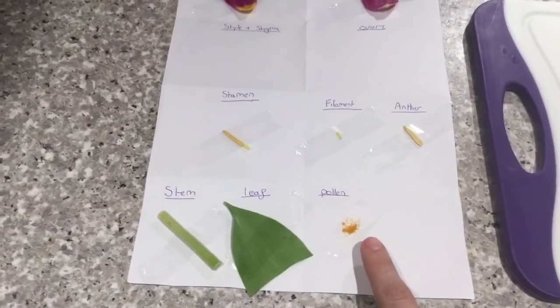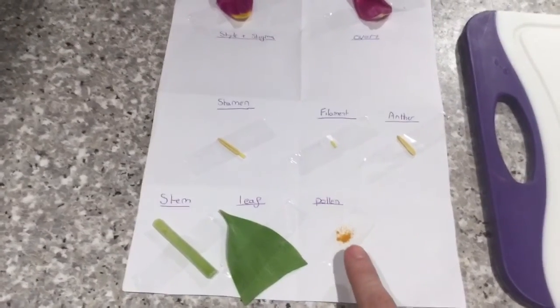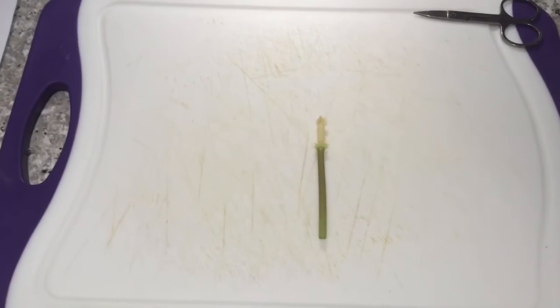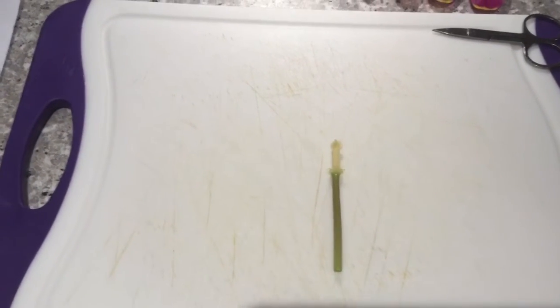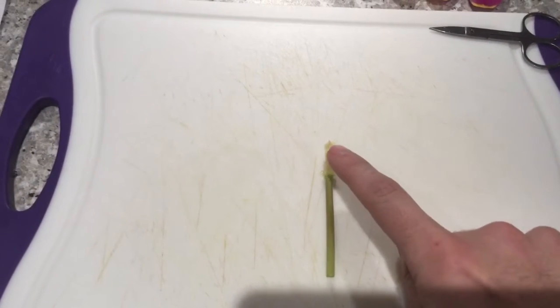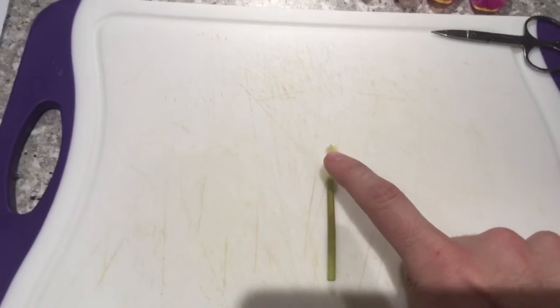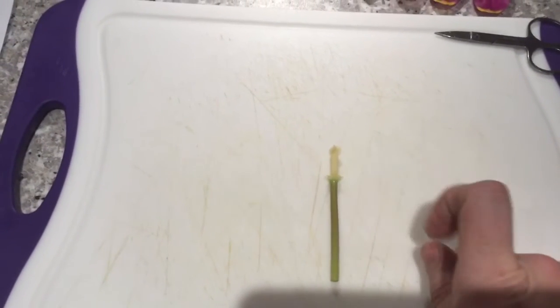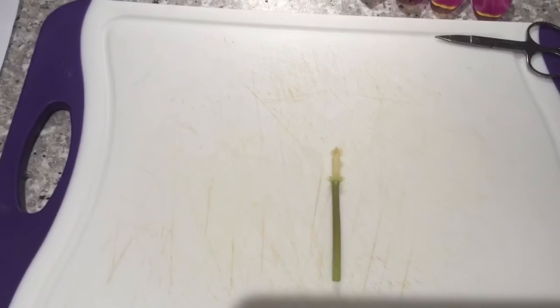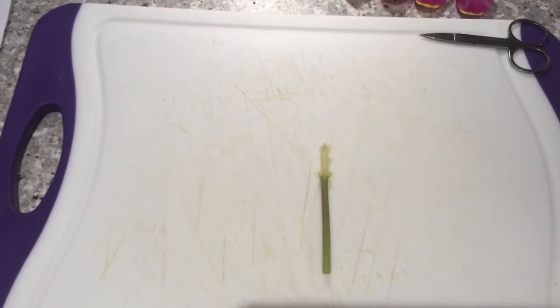You might not manage to get pollen — it just depends how developed your flowers are when you're dissecting them. Coming back to our flower, we're left with the stem which is connected to the ovary, which is then connected to the style and the stigma. So I'm going to cut this top stigma off and then I'm going to slice the ovary in half so we can have a look inside, and both of those are going to be added to the sheet.